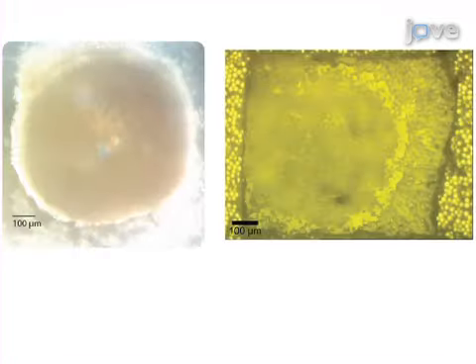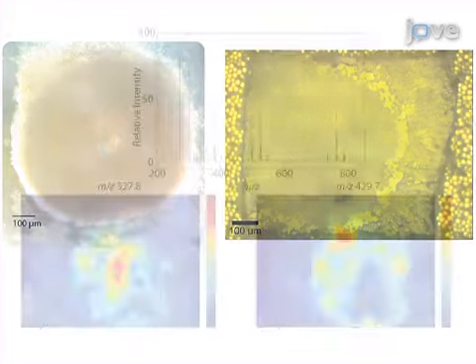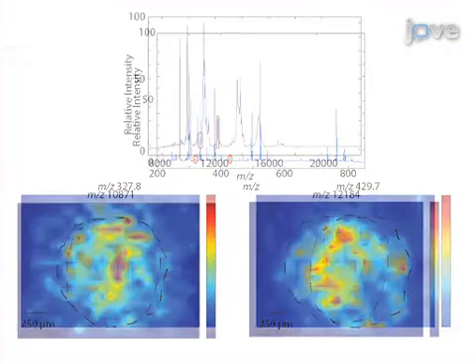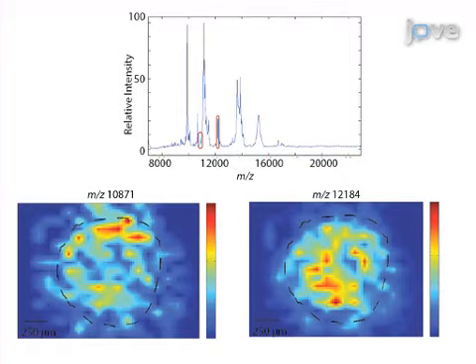Mass spectrometry imaging has the potential to reveal many different molecular distributions in three-dimensional cell cultures. Using the previously described method, species from small molecules to large proteins may be tracked across the culture. After watching this video, you should have a good understanding of how to prepare, slice, and analyze three-dimensional cell cultures by mass spectrometry imaging.